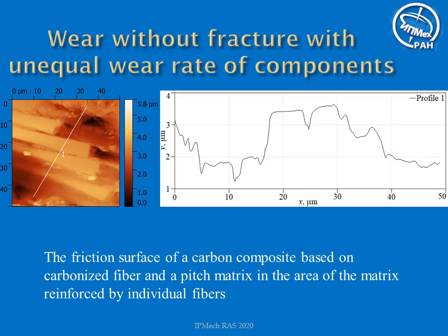This slide shows a surface area of the composite with fibers lying in a block of matrix. The matrix in this area has less wear resistance than the fibers. Therefore, during the running-in, the fibers rise significantly above the matrix, although wear occurs without friction surface fracture.